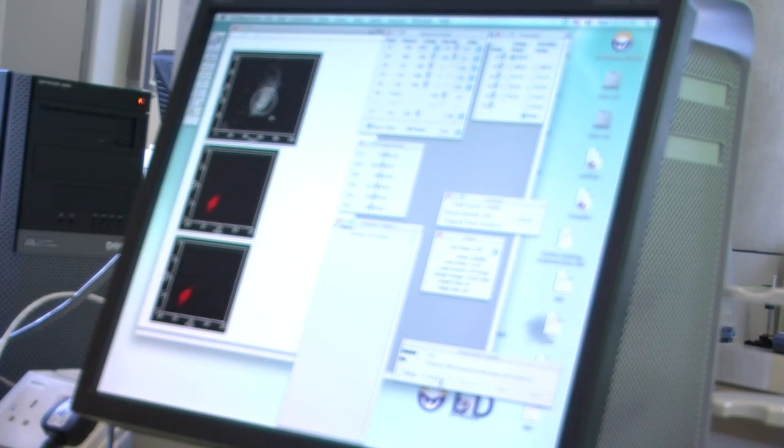You will see that I left a research paper, just out of curiosity, where they do the characterization also of the cell line that they were trying to produce. So they use different techniques, including this one, to do the characterization. So there is a little bit about it. And they have included some of the graphs on their data. So you can also see how to present the data, how to label the images, even a little bit of legends and things. So you can find any of these sections as an example. And you will need to find more in terms of how to advise people. In these ones, you will see different ways of presenting the data. This is just one of them.